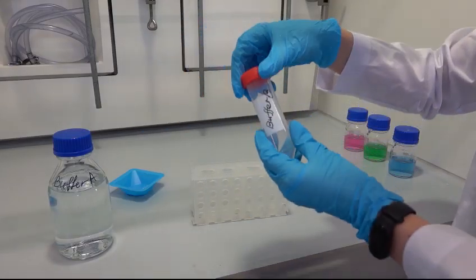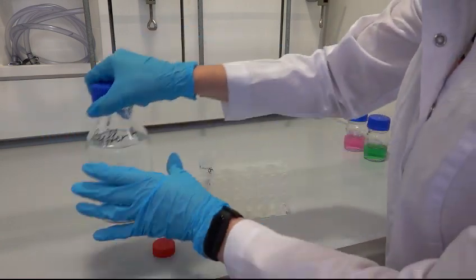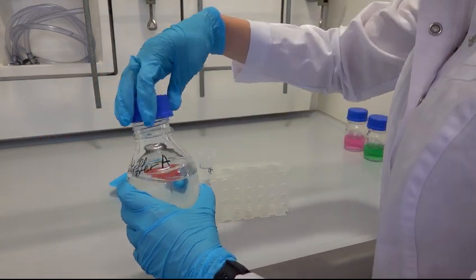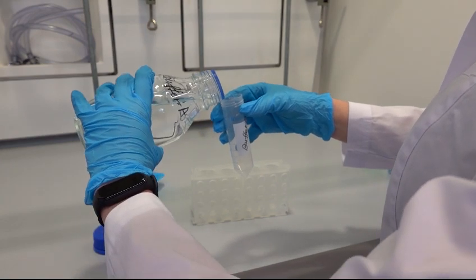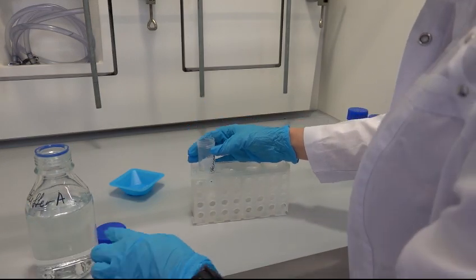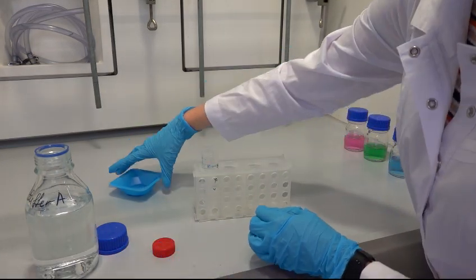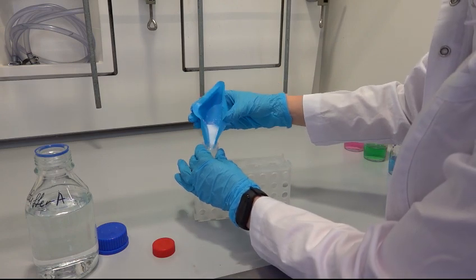Take the previously labeled falcon tube for buffer B and add between 20 to 25 ml of water. Add the rest of the water till the level reaches 50 ml.